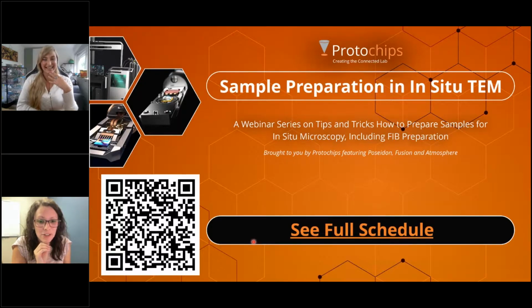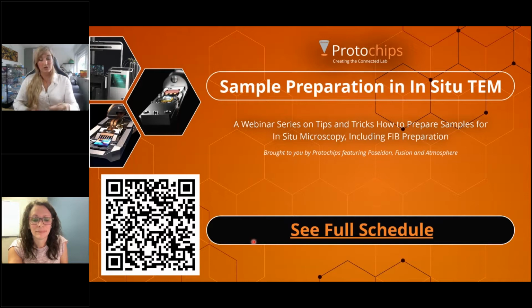For sample preparation by drop casting, would you recommend heating the chip on a hot plate while drop casting or after it to dry the chip? You can definitely do that. Yes, 100%, especially if you really want to keep it centered and you want to have your liquid evaporated as quickly as possible. You can heat our chips up, and Jen, correct me if I'm wrong, I think up to 80 or 100 degrees Celsius on a hot plate. So they can withstand quite a bit. What you would then do is take your chip, drop cast, and then put it on the hot plate to evaporate your sample.